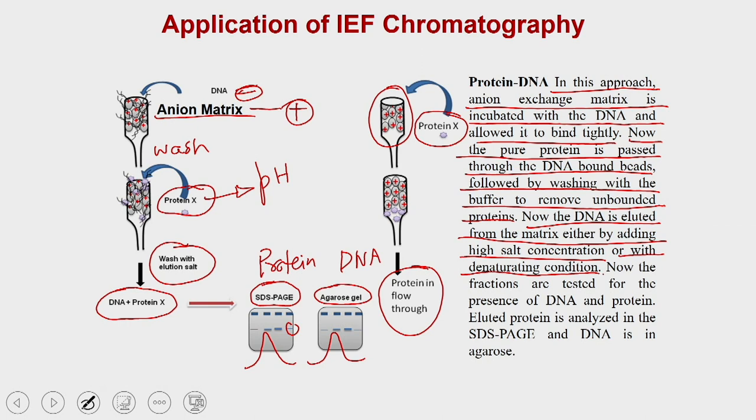Now you can get the fractions, and these fractions can be tested for the presence of DNA on the agarose gel and the protein on the SDS-PAGE. And the eluted protein is analyzed in the SDS-PAGE and the DNA in the agarose gel, and that is what we have said.